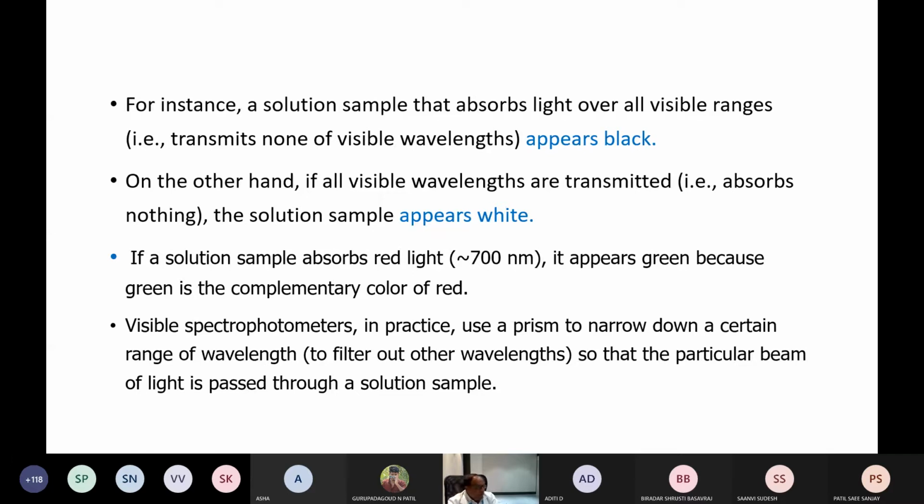In the auto analyzer, scanning of wavelengths will not be permitted; that scope is not there. There also, like the colorimeter, you will have specific filters which are referred to by the word wavelengths only, and they will be fixed wavelengths.